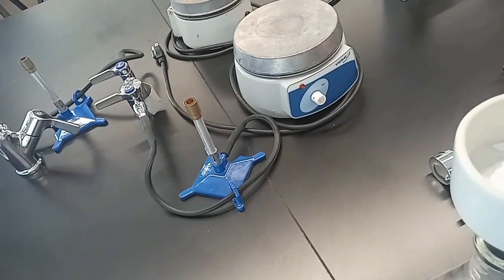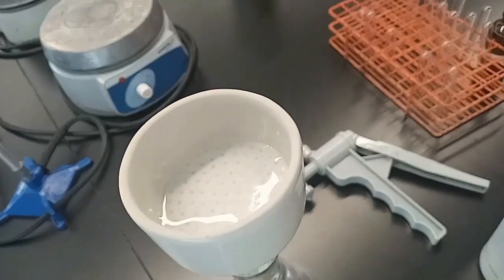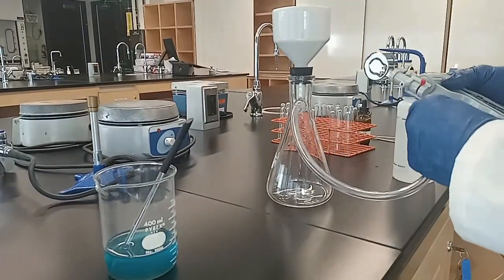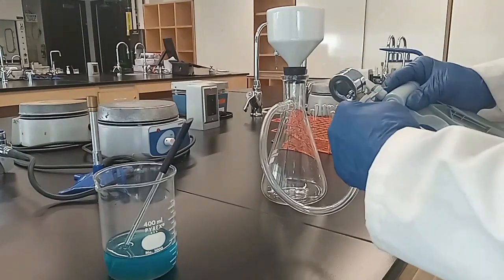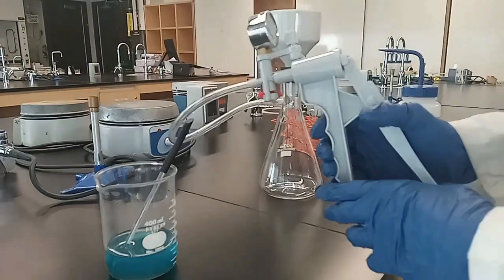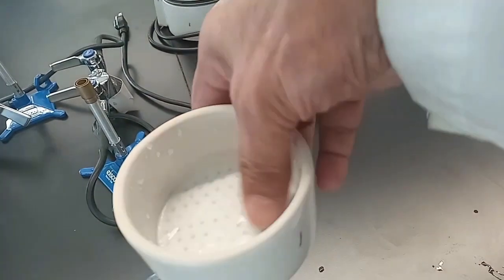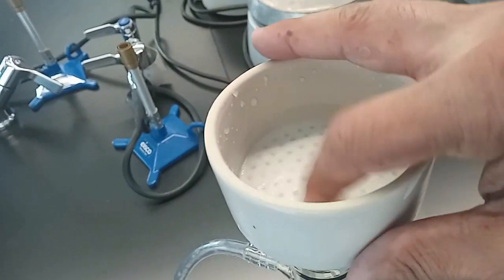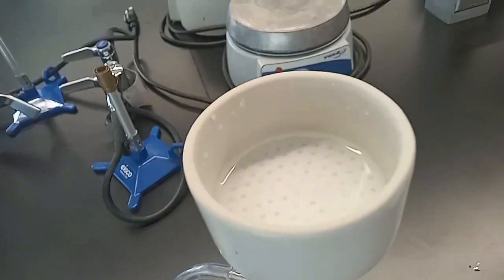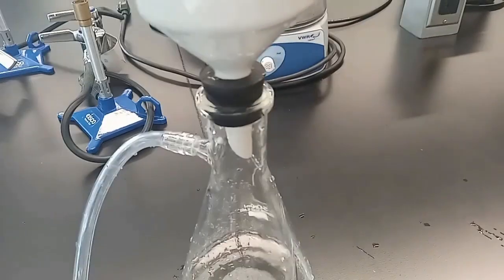Wet with distilled water. Attach the other end of the clear tubing to the nozzle of the pump. Apply suction by pressing and then releasing the lever. Press down the wet filter paper to ensure that the pores are covered. This is done when using distilled water only.